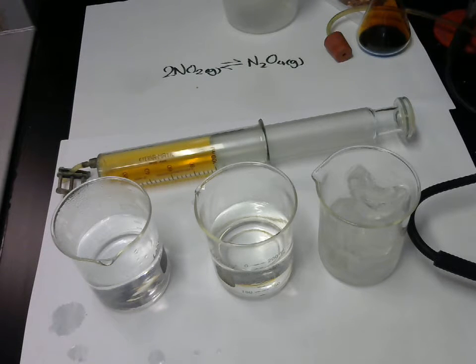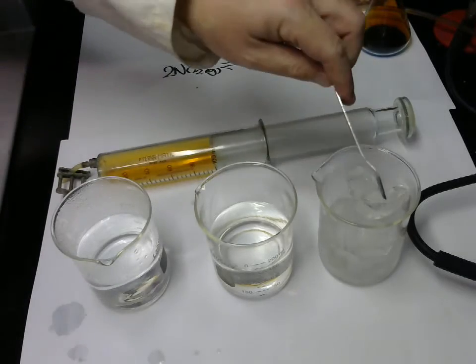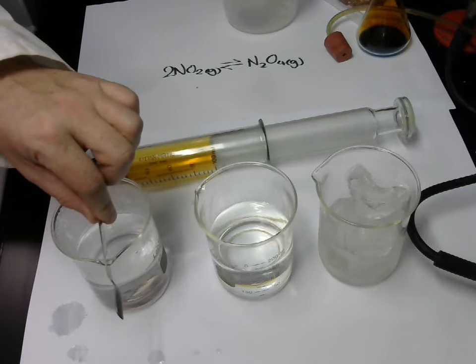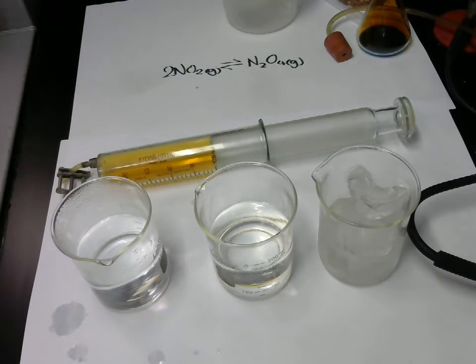One of these reactions, the forward or the reverse, and I'm not going to say which one yet, is exothermic, so it gives off heat energy. The other reaction, the reverse, is endothermic, so it absorbs heat energy. What I've got here is some iced water, and some tap water that is about 80 degrees Celsius at the moment, so very hot. I can use the behaviour of this equilibrium at different temperatures to determine which one is the exothermic reaction and which one is the endothermic. That's one of the conclusions we're going to get to today.